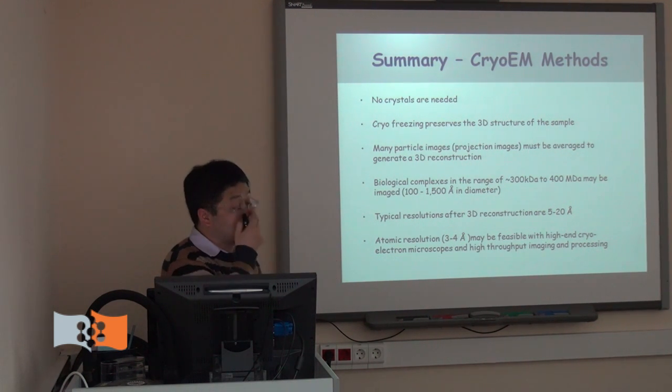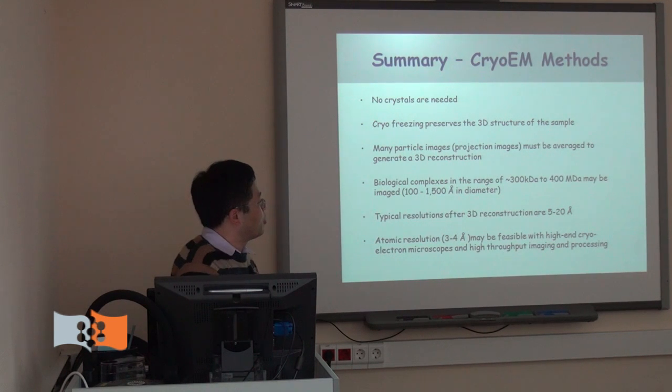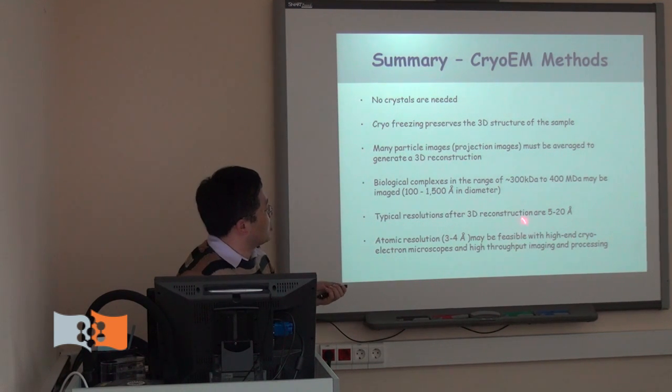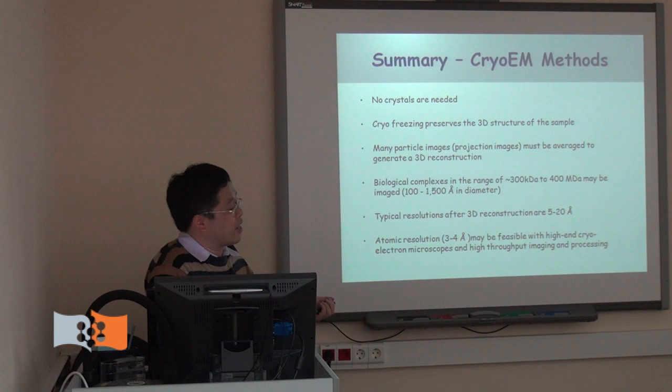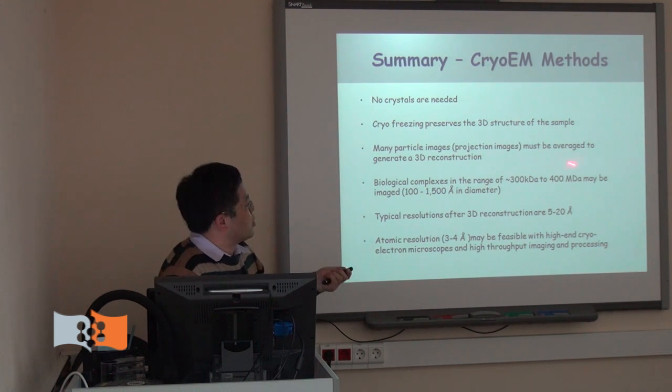Also, the most important thing that a lot of collaborators ask us is that the sample size cryo-EM can deal with is around 300 kD. If it's smaller than 300 kD, it's difficult, but this field is trying to push the limit. Maybe at 200 kD we can give it a try, but less than that is difficult. For a big complex, it's no problem.